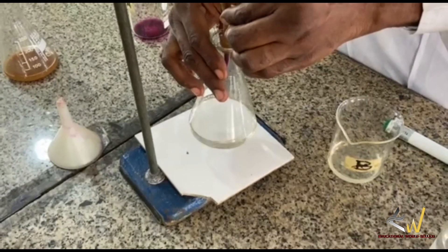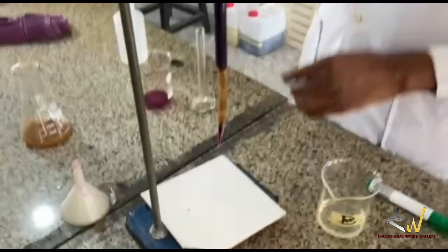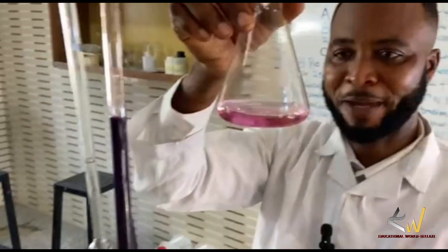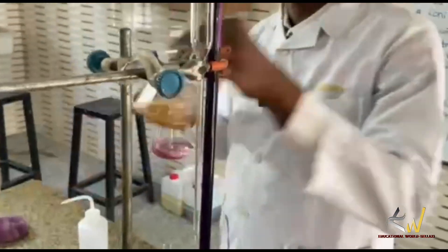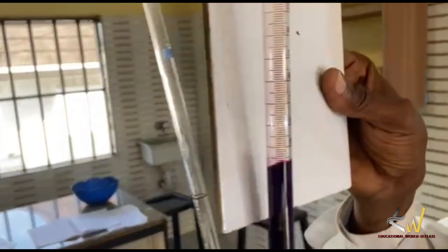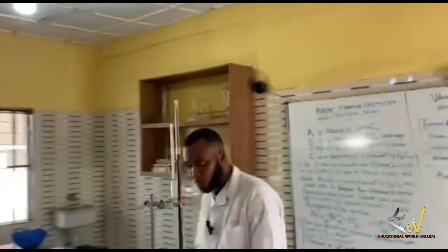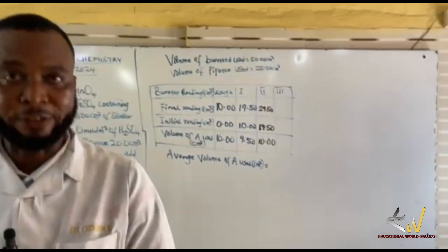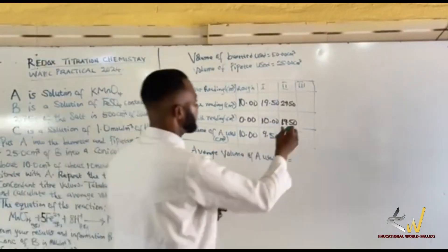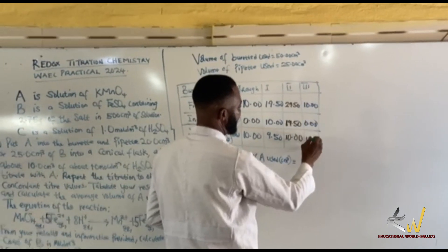I will add drop by drop. It's almost there — that is it. Permanent pink. It will oxidize to this. My reading here is actually 10.00. This is the mark of 10. I return back to my board for my calculation. I'm done with my titration. I set it from zero when I refilled it and I got 10.00. So this is my final reading.